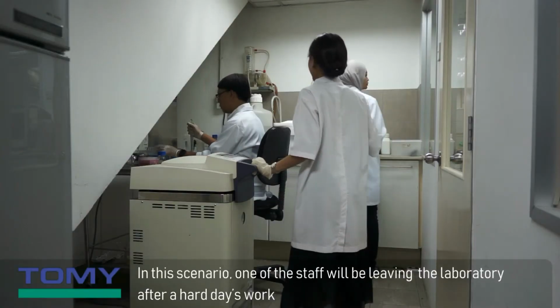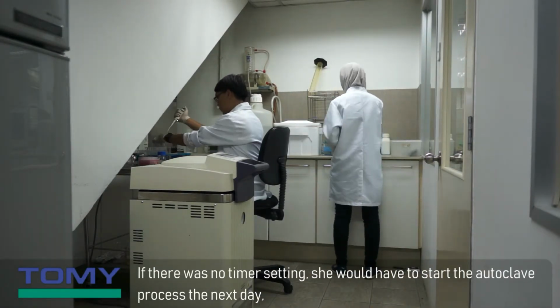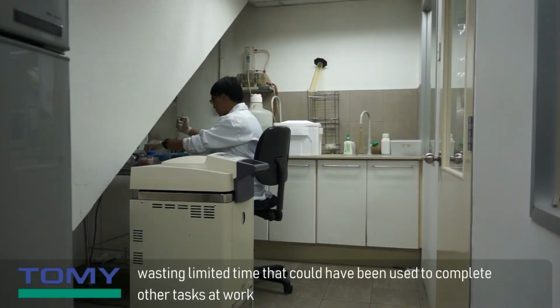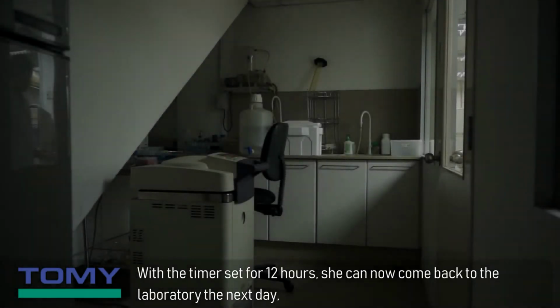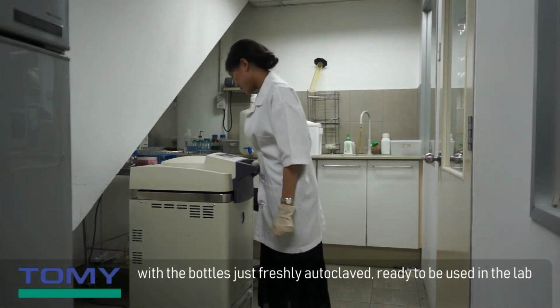In this scenario, one of the staff will be leaving the laboratory after a hard day's work. If there was no timer setting, she would have to start the autoclave process the next day, wasting limited time that could have been used to complete other tasks at work. With the timer set for 12 hours, she can now come back to the laboratory the next day with the bottles just freshly autoclaved, ready to be used in the lab.